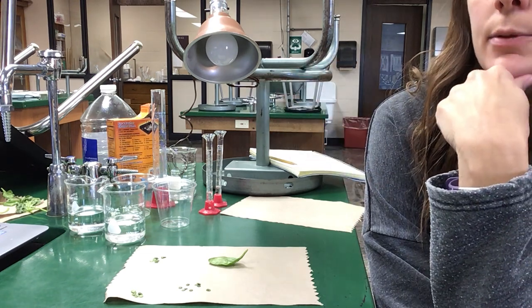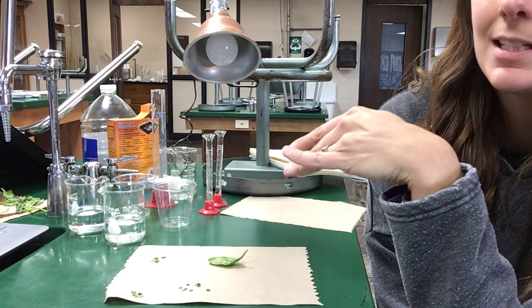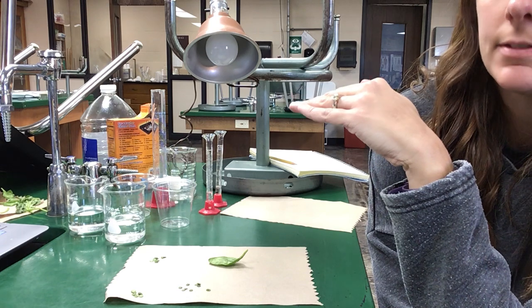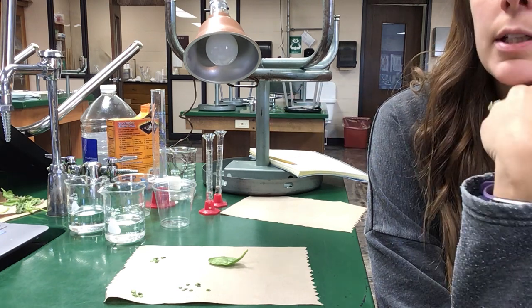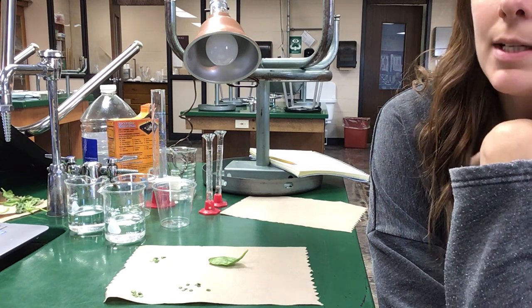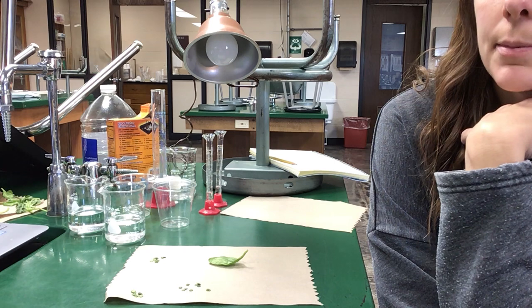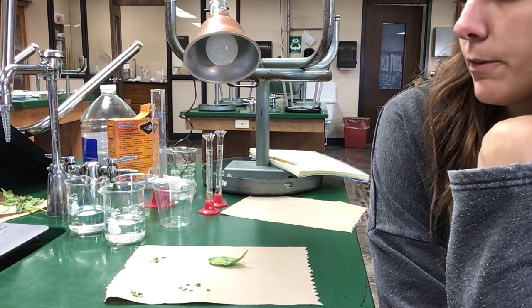So that waste product of oxygen in photosynthesis is sitting in these spaces that make these leaves float on water. What we're going to do is infiltrate those spaces and put carbon in them by using a bicarbonate solution that we made, which was in your procedures in the first 5 steps.